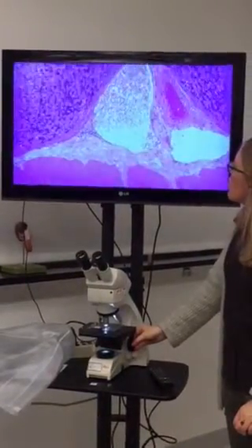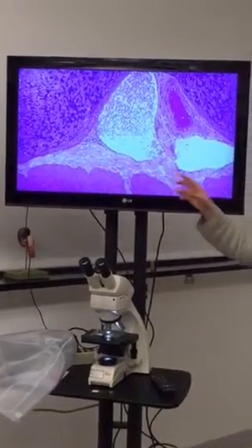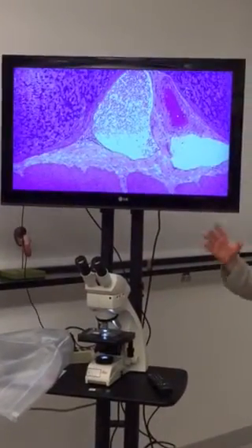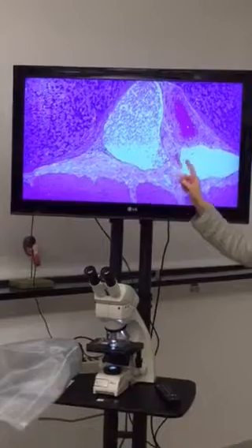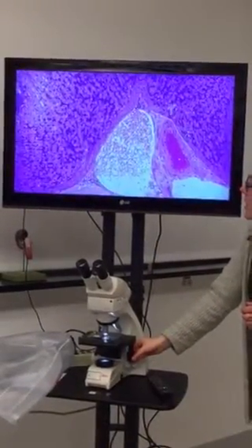Then you have the submucosa. Notice though, the submucosa of the esophagus had all of those esophageal glands that had a distinct look to them. Here you have mostly blood vessels. Okay? The glands of the stomach are going to be in the lamina propria.